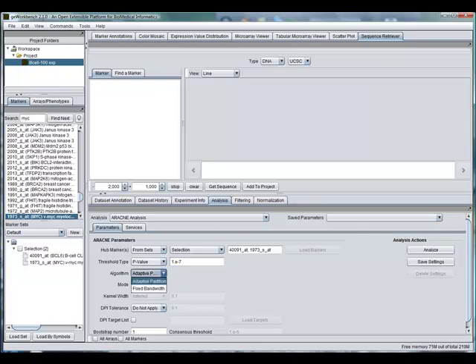There are 2 algorithms offered with which to calculate the pairwise mutual information between markers. One is adaptive partition, and the other is fixed bandwidth. We are going to use the adaptive partition. Again, please refer to the original paper or the geWorkbench main project site to find out more about the reason behind which algorithm you use.